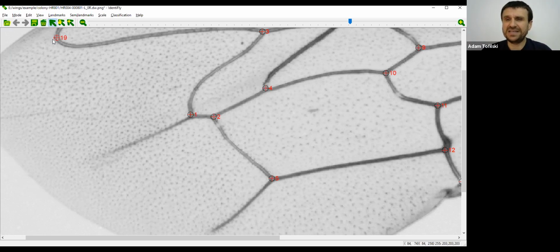But again, the wing base would not be visible. So for venation it's good, but for wing length as defined by Ruttner, it's not so good. Using those points, it would be enough to measure if the queen is big or not, but not for size, because for the subspecies we don't have references.